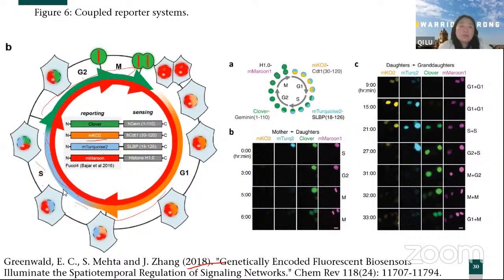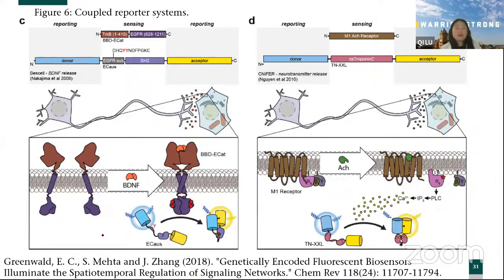And if we add more filters to see a merged image, and we see a green shows up, that means it's at the late stage of S. And if it's in the early stage, we know that it's between G1 and S, and here there's orange and also red. So I think this is pretty cool. That can tell the cell cycle stage of mitosis.